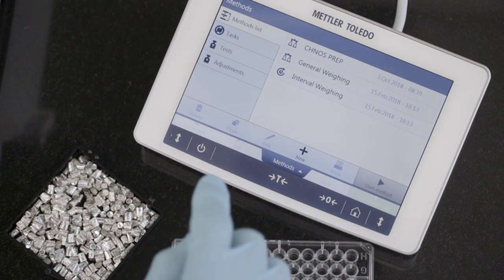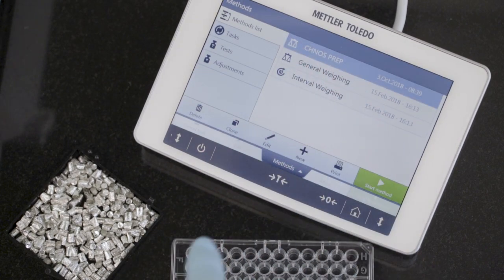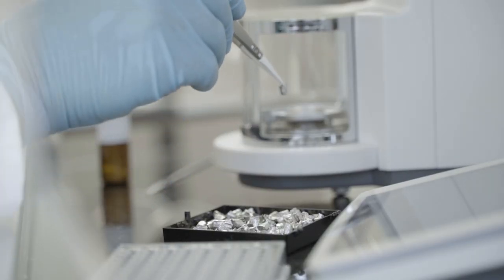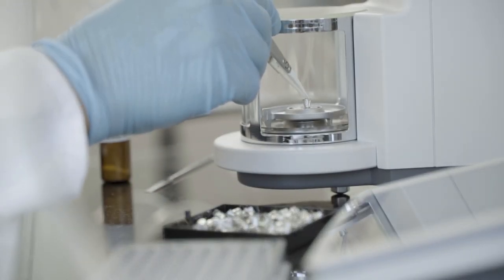Saved weighing methods ensure correct procedures are followed. The automated doors are operated with the wave of a hand, making weighing out the sample into the tiny crucibles faster and more ergonomic.